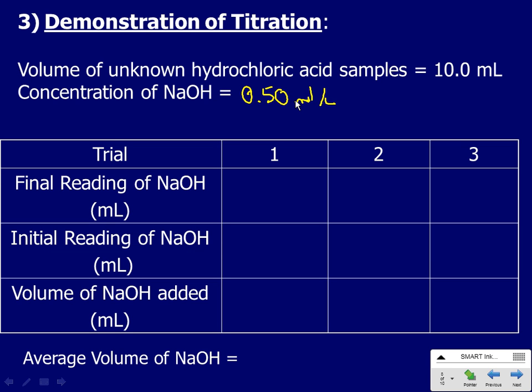So, back into my base beaker, which is fine because it shouldn't be contaminated at this point because I've cleaned it 3 times. What I do now is I open the tip wide open and I give it a little tap. There's some bubbles left, and there, all the last bubbles came out. Could you see the bubbles kind of shooting out there? If you're in the front, you could see the bubbles maybe. Now that's full.